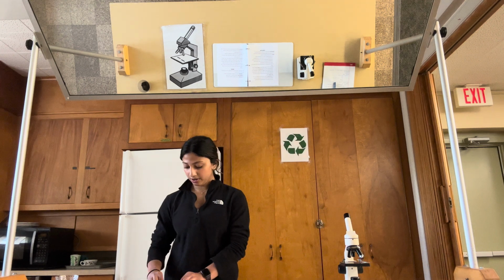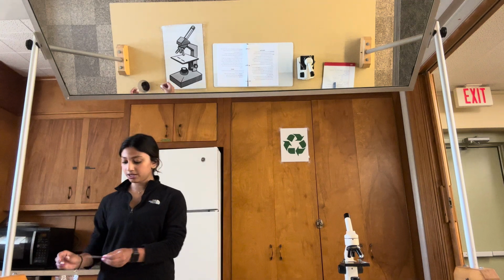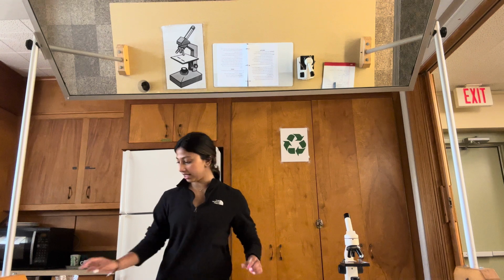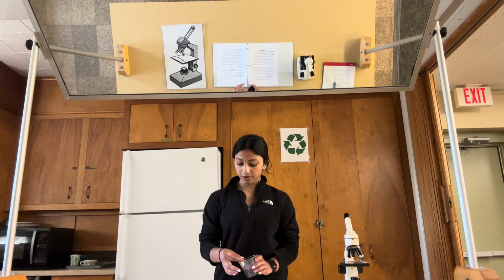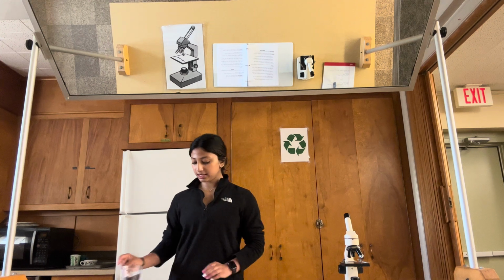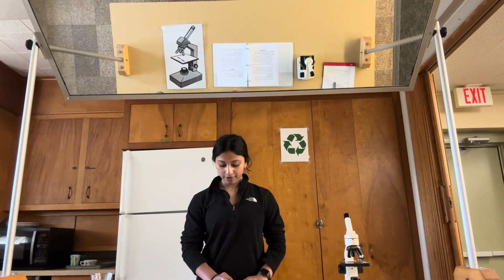Okay, so to prepare your own slide, we're going to take the slide and the cover and then take your sample. In this case, it will be some potting soil, and place it in the center, placing the cover slide on top to cover and protect the sample.